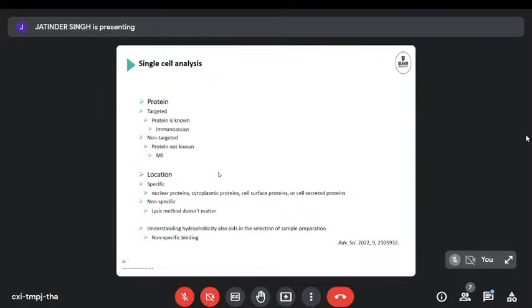And of course you need microfluidic tools, the ability to handle reagents in very small volumes, because we can deal with a tube, even if a single cell is in there. We really need new technology if we want to look at the absolute locations where proteins are expressed, preferably in a dynamic manner.